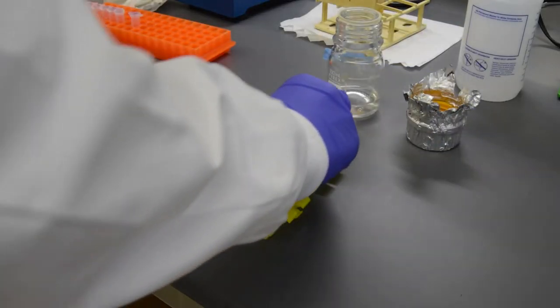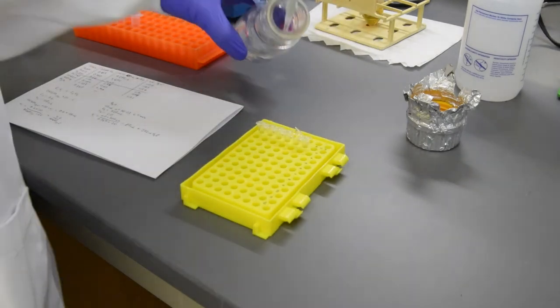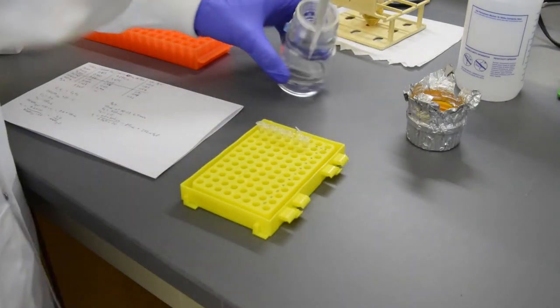Make the appropriate dilutions by mixing water with your cell suspensions. I usually measure out the water into PCR strips first, then add cell suspension.